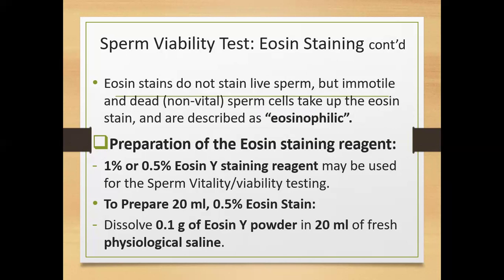No. Since that is a stock, we are not. I just used that one as a case scenario for you, that the test requires that you can use 1% or 0.5%. So in that case, if you're in your lab, you can prepare 1% and put it down as a stock. Next time, if you need some, you can take some. But I'm saying that I want you to be able to prepare 20 mils of 0.5% in the lab from scratch.